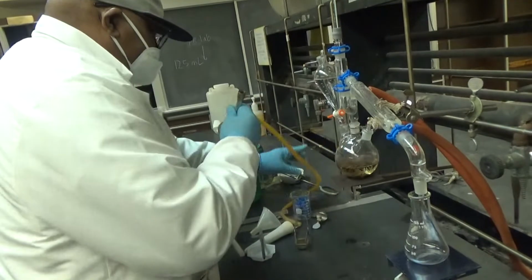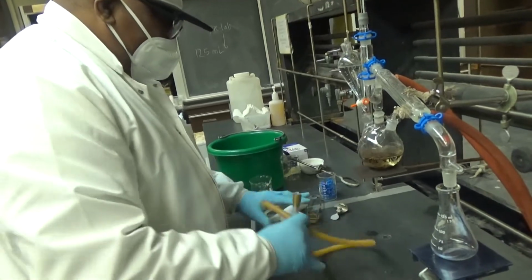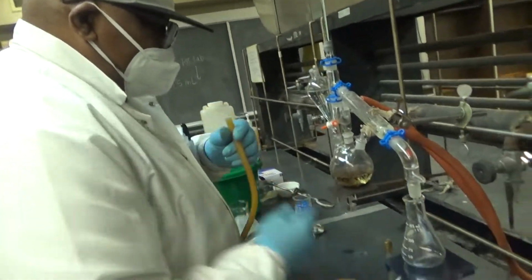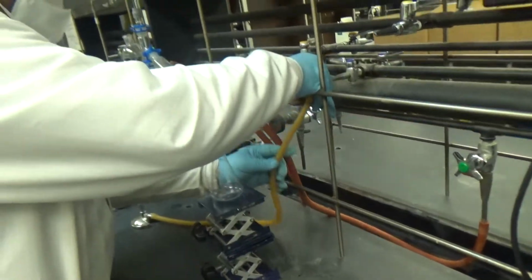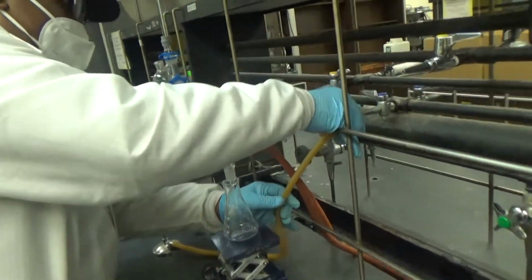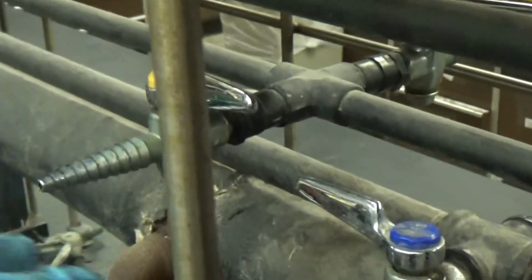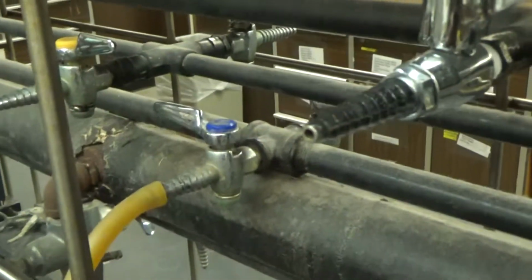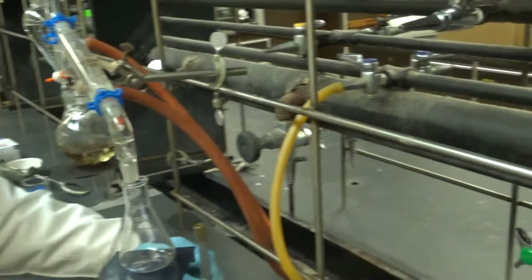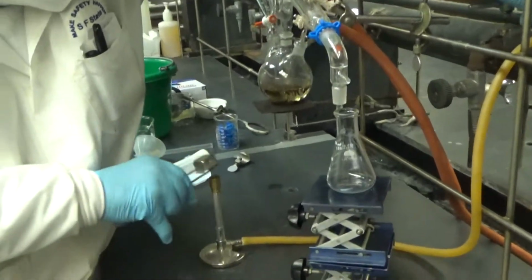So now, the next step, you need to use a Bunsen burner. You're attaching the Bunsen burner to the gas. The blue one is the gas. What's the yellow one? The yellow is the vacuum, and orange is air. So we don't want those. We want the blue, which is the natural gas. You're going to give it a little bit of gas first. You have to be very careful, very gentle.